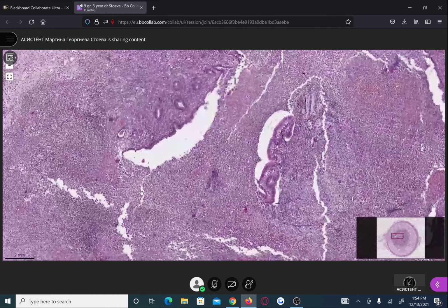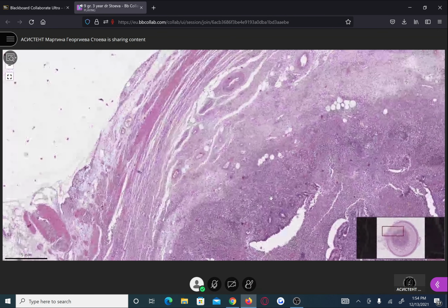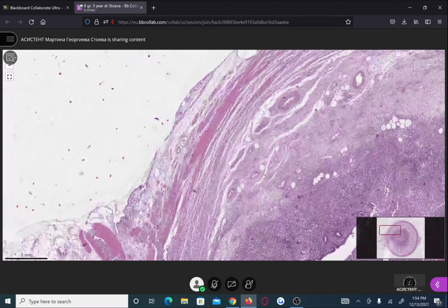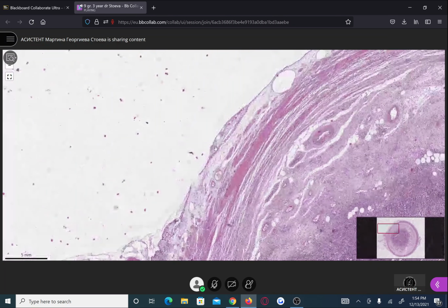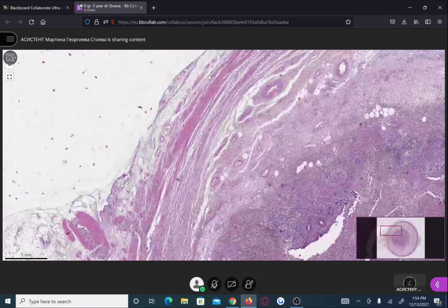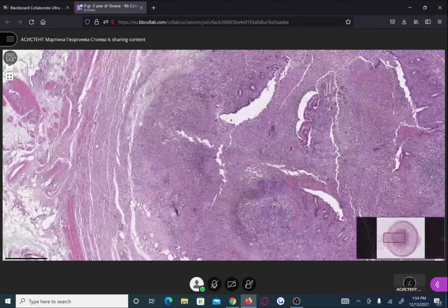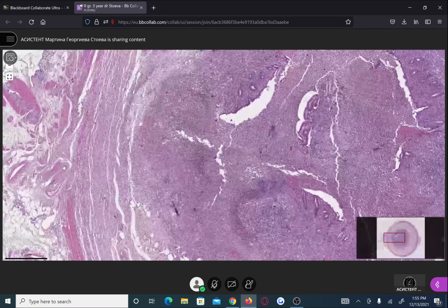So this is the mucosal lining, actually only remnants of it. The next layer is submucosa, after it lamina muscularis propria, subserosa, and serosa is the outermost layer. Here in the slide, it's quite well visible that we have some dark areas throughout the whole layers of the wall.